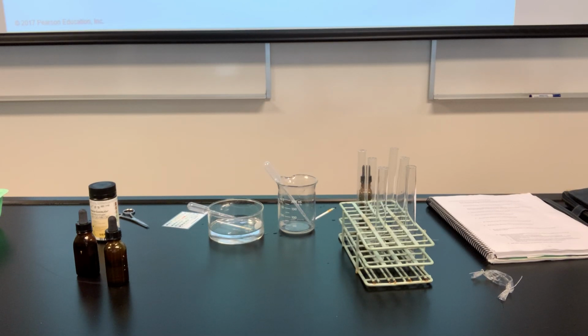All right. The slide with the blood sample on it. I'm going to have a dish with bleach in it. You're going to simply throw it in there. Sound good? The tubes with blood. Listen to this one. The tubes with blood. You're going to drop it here. You're going to rinse once with bleach. You're going to drop it in here. And then you're going to rinse and put like this on this rack. You're gonna clean up your microscope, you're gonna get it ready for storage, and I will come around and check it once you raise your hand.